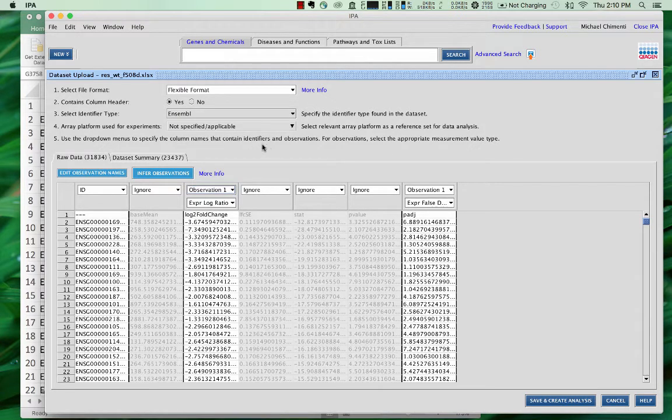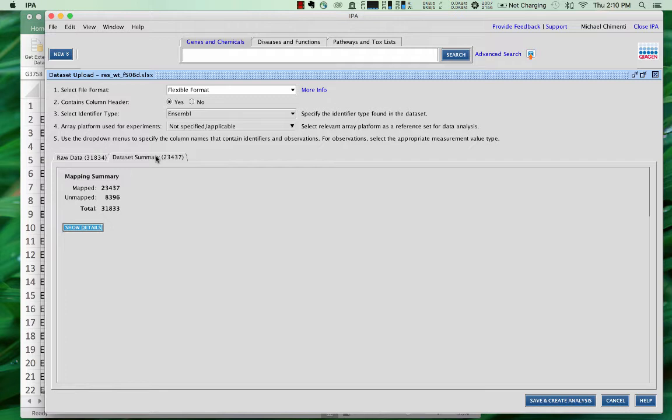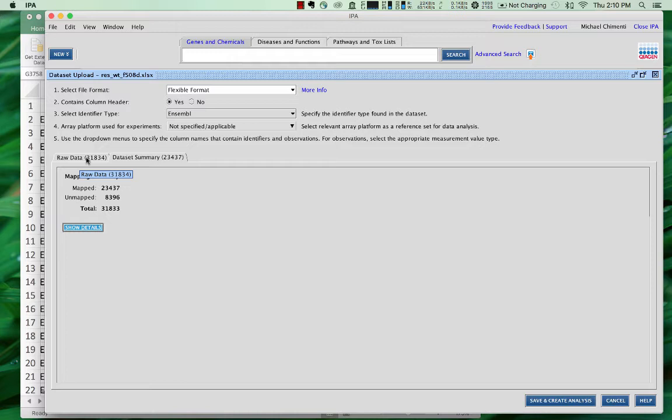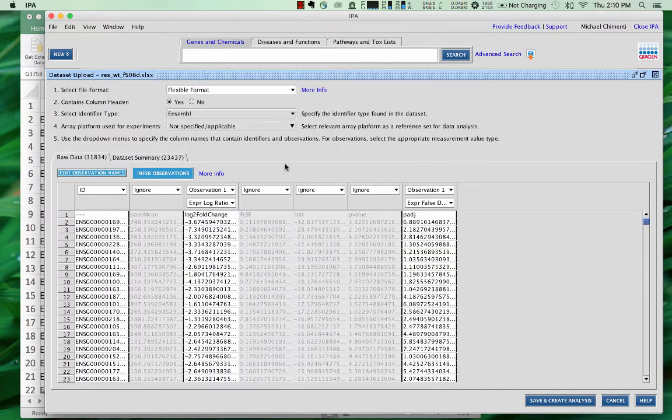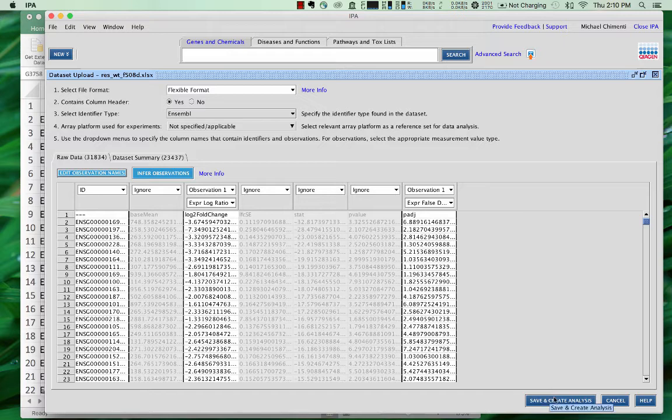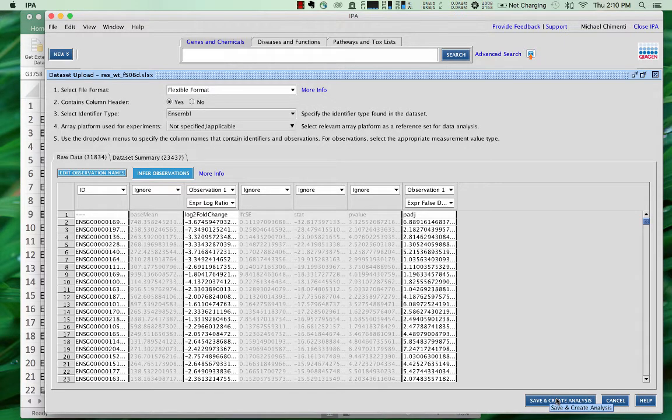Now it tries to summarize the data. It shows you what it can map and what it is not able to map based on its database, so we'll end up with 23,400 genes in this analysis, basically. And so now you say save and create analysis.